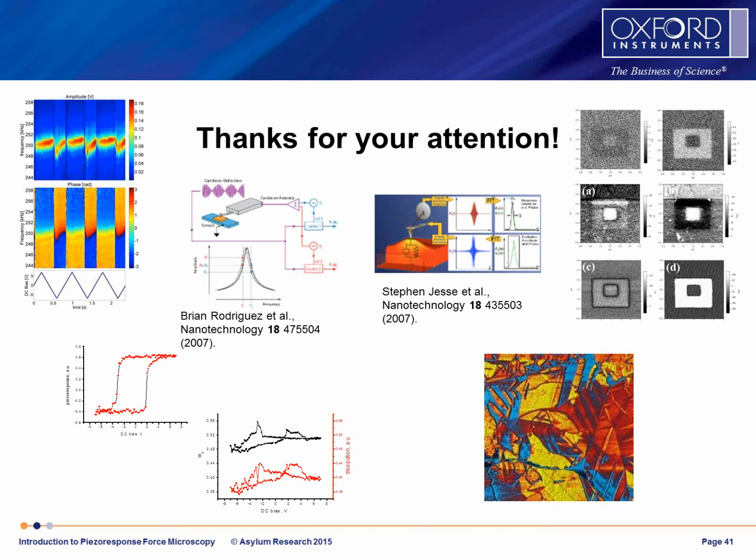And you would like that difference to be at a rate that's higher than the feedback bandwidth of the microscope. So in practice, depending on the microscope, you might have a feedback loop that's between 1 to 5 kilohertz, and so you'd like that difference to be above that. So usually, if I'm scanning slowly, it's at least a few kilohertz, and if I'm trying to scan more rapidly, maybe 10 to 20 kilohertz.